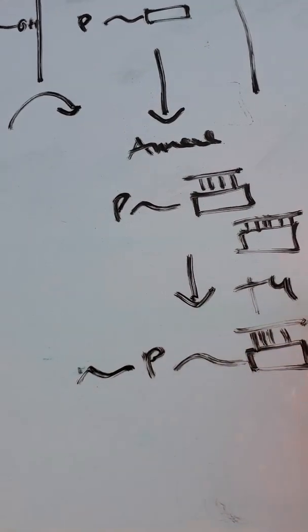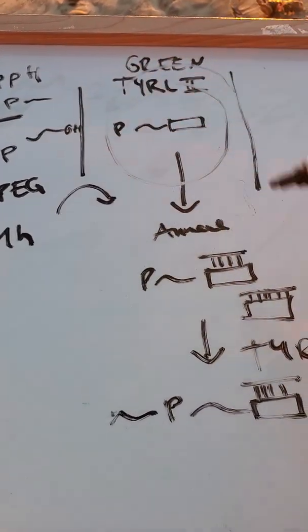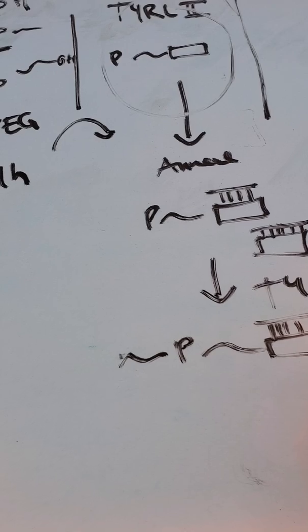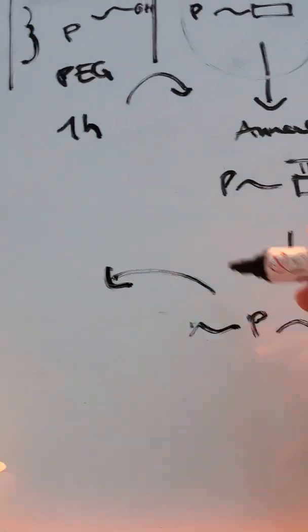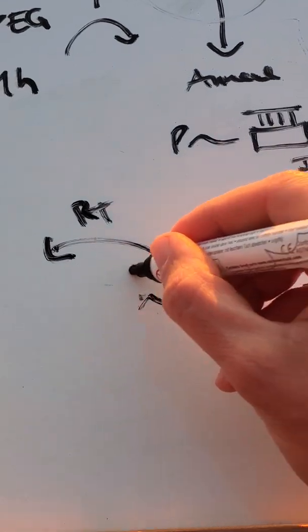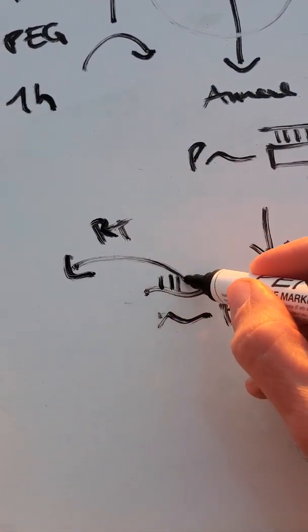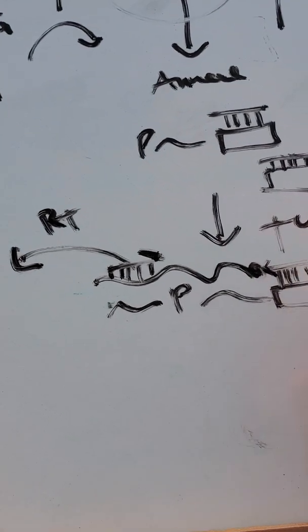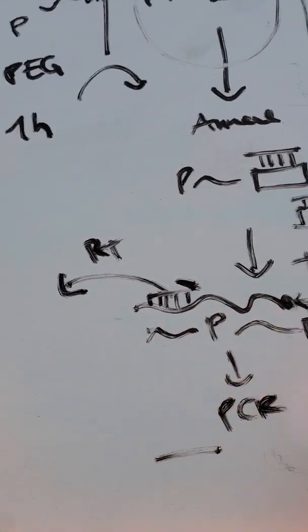And this is done by T4 RNA ligase 1. Out of all the steps tomorrow, I forgot to say, this is the rate-limiting step and the expensive one. This will take us another hour. This is the yellow tube. Once this adapter is on, we can just add the RT master mix, and the reverse transcriptase will just prime off, using the annealed primer, and make cDNA. This will then have our 5' adapter and our 3' adapter here that we can then use for amplification using PCR. And in this PCR reaction, we will also add the barcode for our unique identifiers.